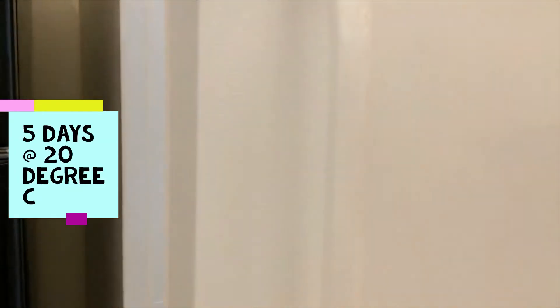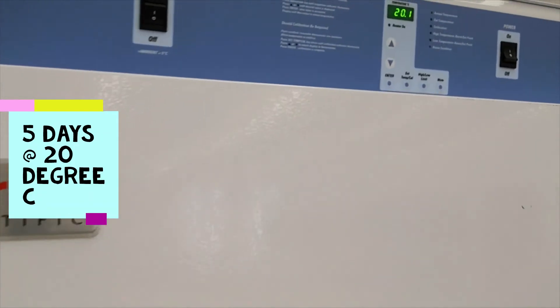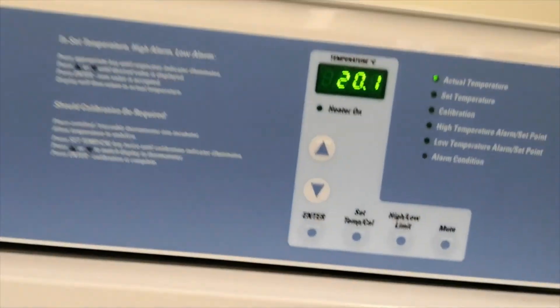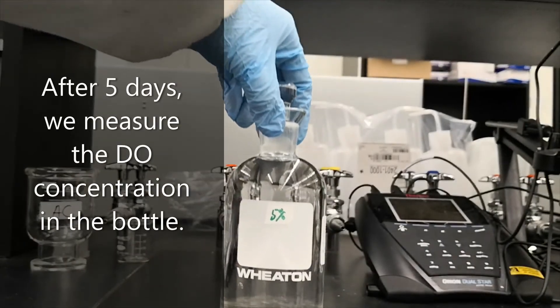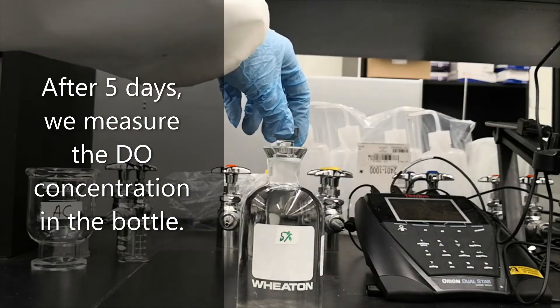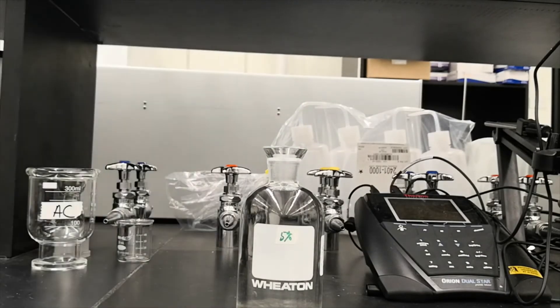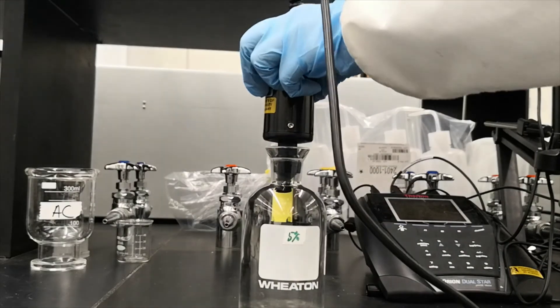We are going to keep BOD bottles in the incubator for 5 days and temperature will be 20 degrees C. After 5 days, we measure the DO concentration in the BOD bottle to see the changes in DO concentrations.